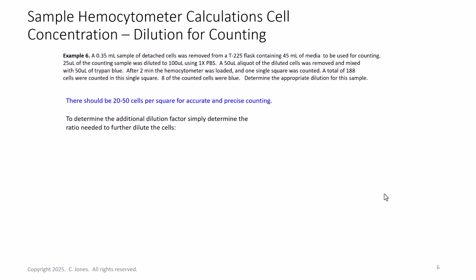So this is the same thing. You guys should pause right now and see what you come up with. And also try to give me some values, that is the volumes of cells and diluent of PBS or HBSS that you would use to get this dilution accomplished. So counting to 5 and then coming back.